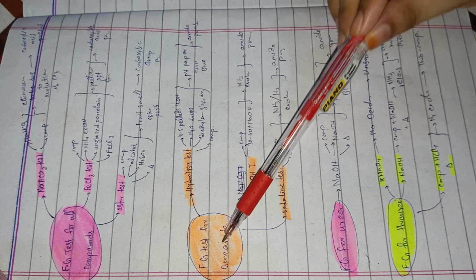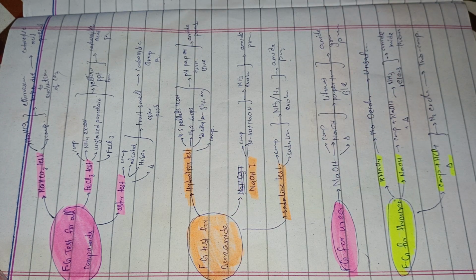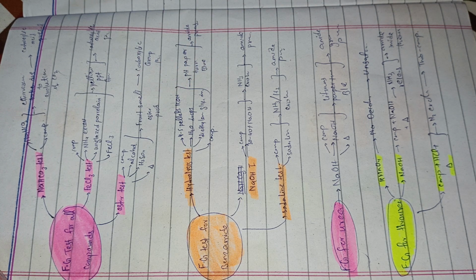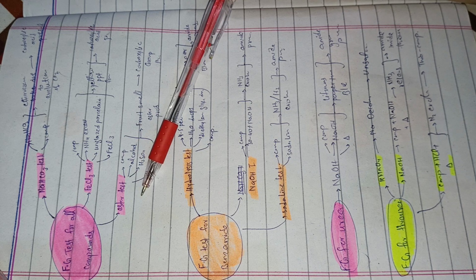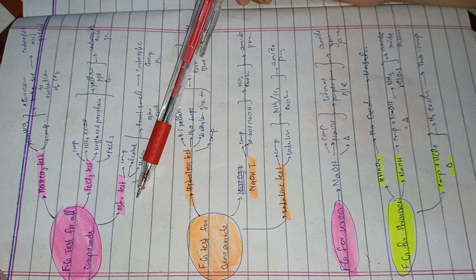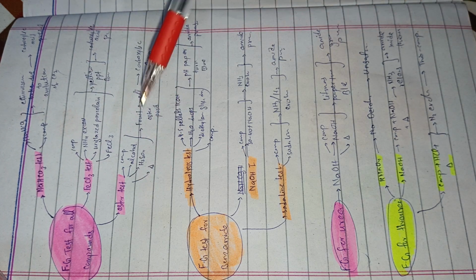So except benzamide, urea and thiourea, all the compounds, whether it is benzoic acid, salicylic acid, citric acid, mean all the acid compounds, except carbohydrates, have three similar tests. First is the sodium bicarbonate test, then the FeCl3 test, and last is the ester test. So how are you going to perform it?